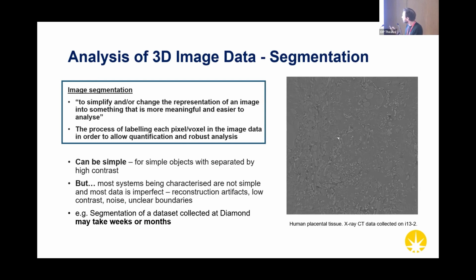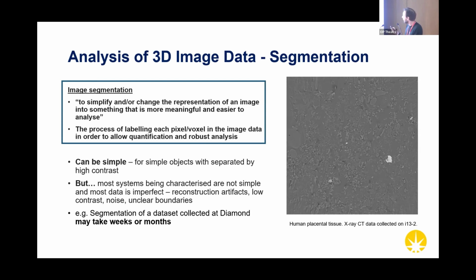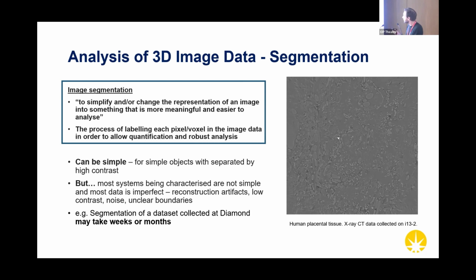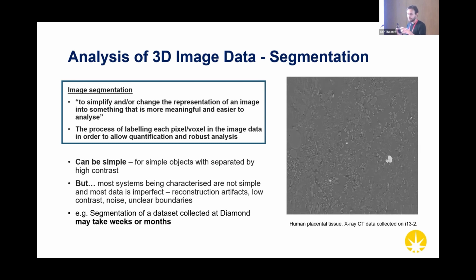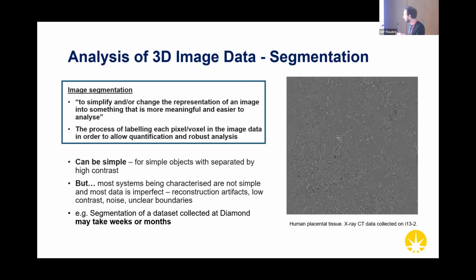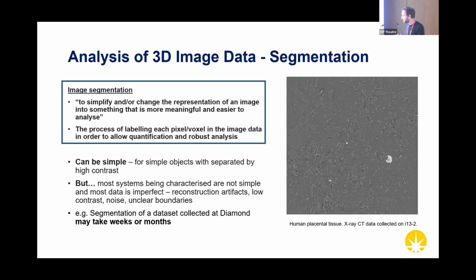So we've got blood vessels. These blood vessels belong to the baby, the fetus. And around we've got some tissue. This is called villus tissue. Between these tissues, we have maternal blood volume. So basically these tissues are bathed in maternal blood, and this is where the nutrient transfer happens in the placenta. I'll talk about this a bit more when we talk about the results of segmentation from the software.